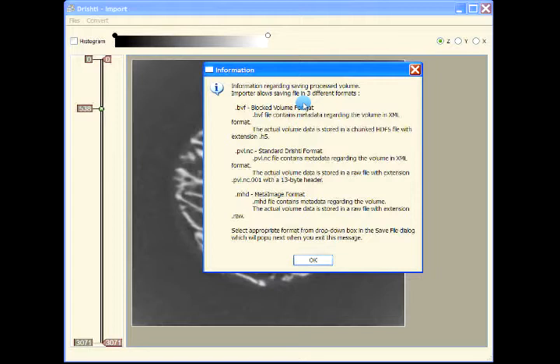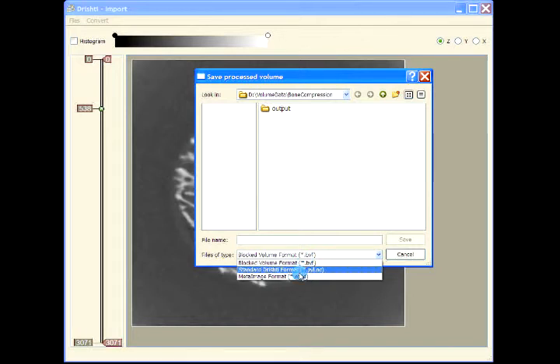The pvl.nc format is what the slice-based version can understand, and then there is also the meta image format, the .mhd format that Voluminous, the cloud-based renderer that Drew Whitehouse has written, which is available from the NCI ANU website. Voluminous expects an .mhd file. So this importer will allow you to export the data into these 3 different formats. You can choose your format from this drop down box.